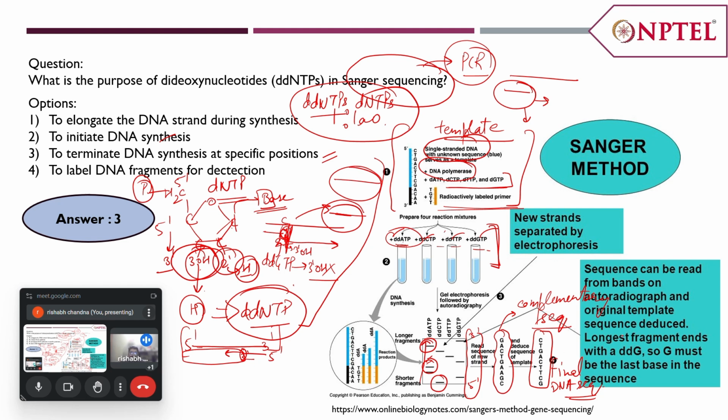So this was the original technique that was used by Sanger. Now modifications of this technique are used.